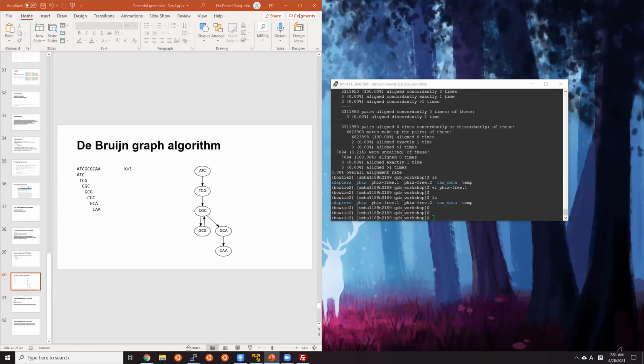Sorry about that. So I guess you can try out very different sizes of k-mers for SPAdes.